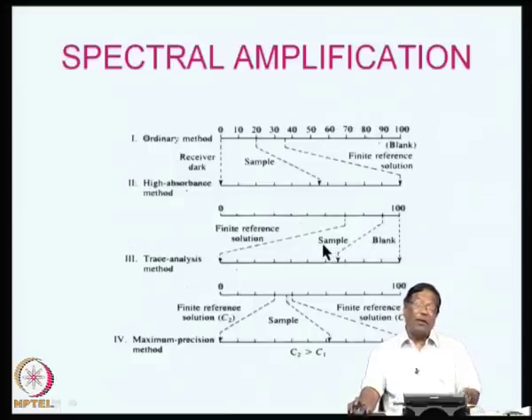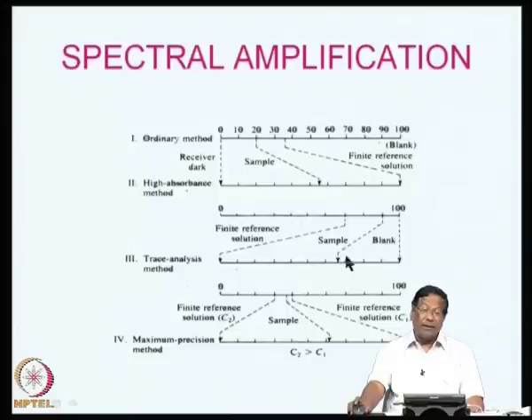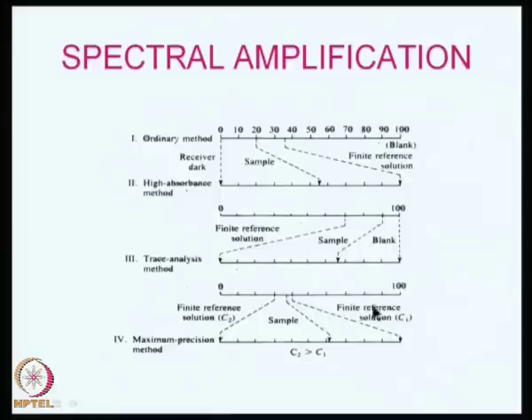So, in such cases accuracy would be better than the standard method, because here the sample is in very low concentration. Sometimes, with precious metals etcetera, we need to be still more accurate. We are neither on the higher absorbance scale nor on the low absorbance scale. In that case we take two standards, one standard is here, another standard is here. These two we adjust for 0% and 100% transmittance, and then the sample would cover a small portion, and the standard would cover the whole absorbance range. These things are known as the maximum precision method, trace analysis method and high absorbance method.